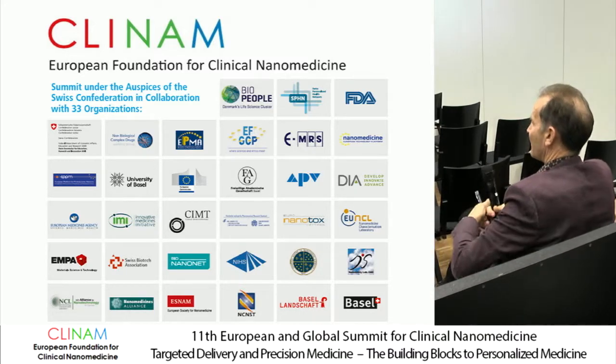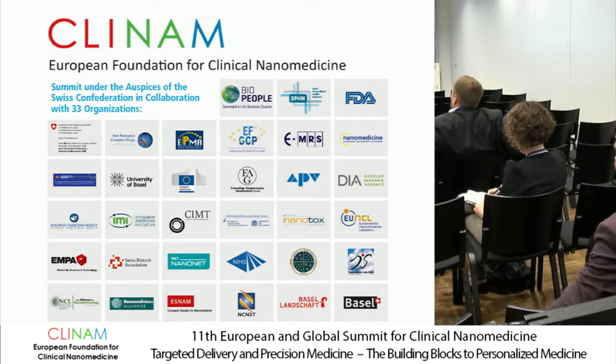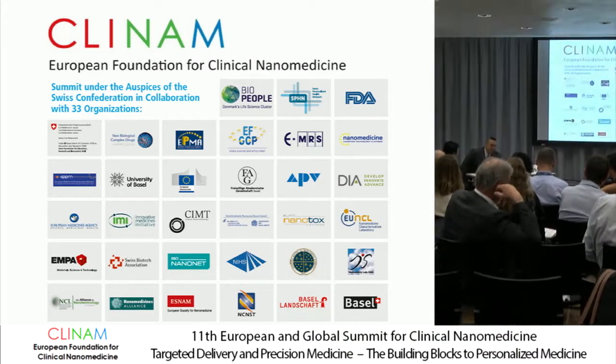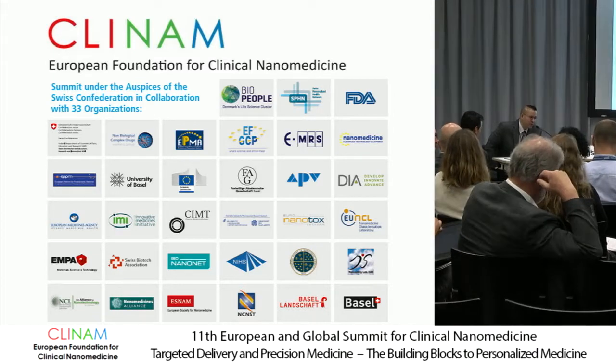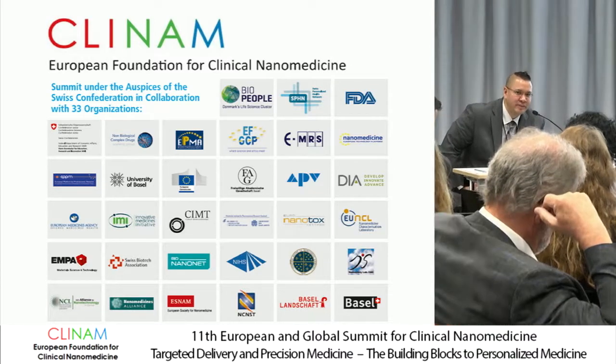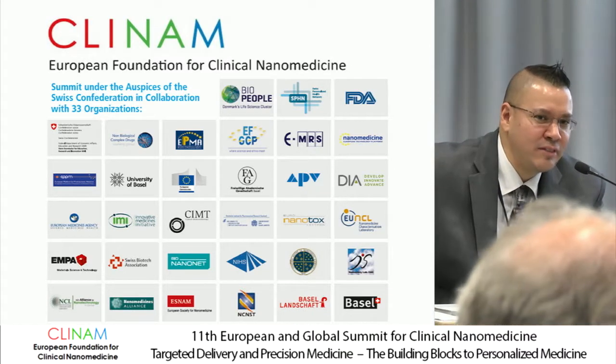Yeah, I agree. That goes back to the whole orthogonal methodology. And I agree with sizing. There are so many different ways out there. When you report a number, you need to report how. First of all, what measurement you use. Even just take DLS. Everyone here, I think, is familiar with DLS. With DLS, you have intensity, number, volume weighted, you have Z-average.